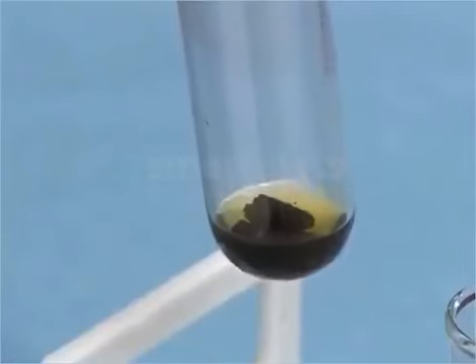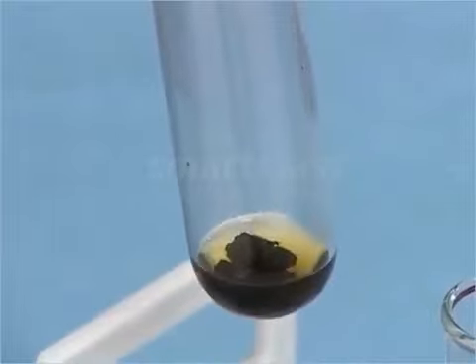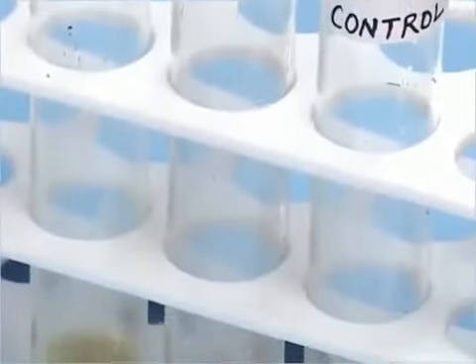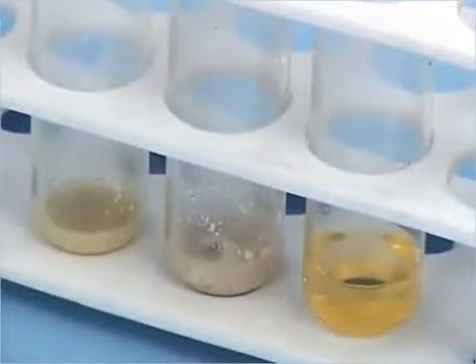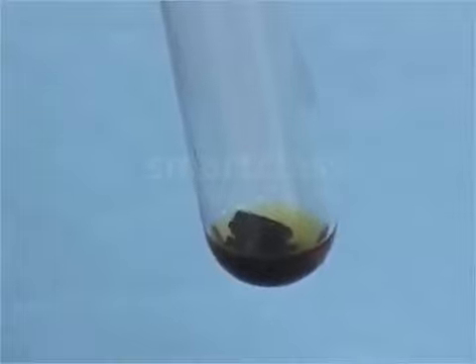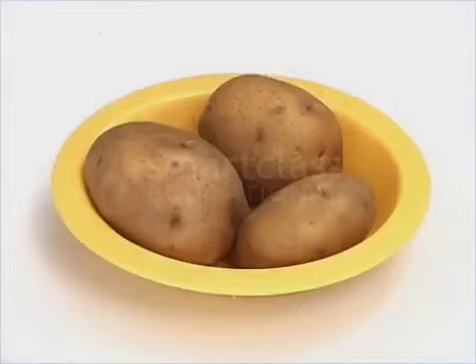What do you observe? The potato piece in the test tube A turned blue-black. You can also observe that no change has occurred in the test tubes B, C and D. Starch reacts with iodine solution to give a blue-black color. The test tube containing potato showed blue-black coloration. This confirms that potato contains starch.